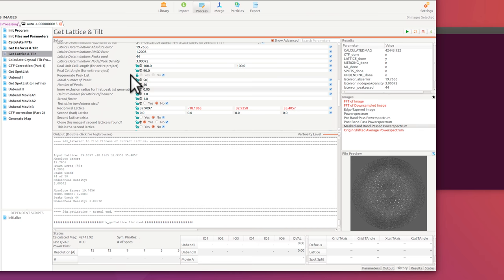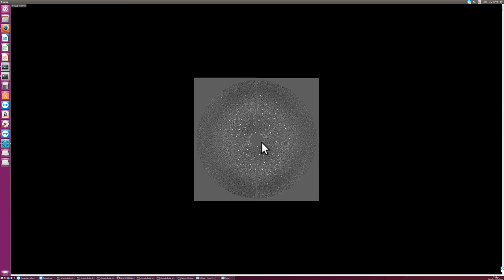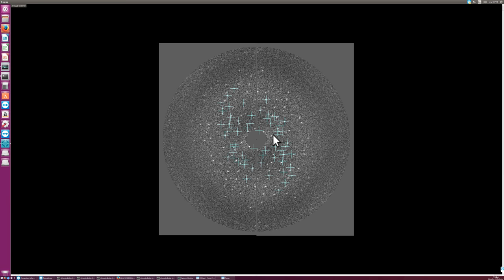And so what happens then is that on all these 50 peak positions, let me just open this here. This is the image that we just looked at. On all these 50 positions, a peak is searched, and with shift P, I can display these coordinates. So this is this shift P, to view the peak list. This is less than 50, so maybe it's on the entire Fourier transform. This was at 60 before. So the strongest peaks here are found. Some of them look really odd. I don't know why it would pick a peak there. Or maybe this is the wrong peak list. I can load a peak list here, load peak list, but I don't go into this. But the idea would be that it searches for the most important peaks here.